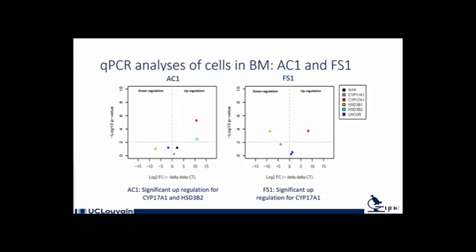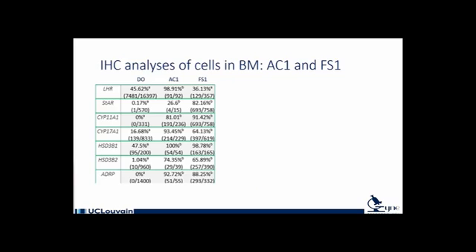Although these two cell groups in G1 show different mRNA and protein expression involved in the steroidogenesis of theca cells, they were both significantly positive for CYP17A1 mRNA, which is a marker for theca cells. This made us believe that cells were indeed differentiated into theca cells. As you see, for the immuno results in attached and floating structures, almost all the genes involved in the steroidogenic pathway, these proteins are expressed.